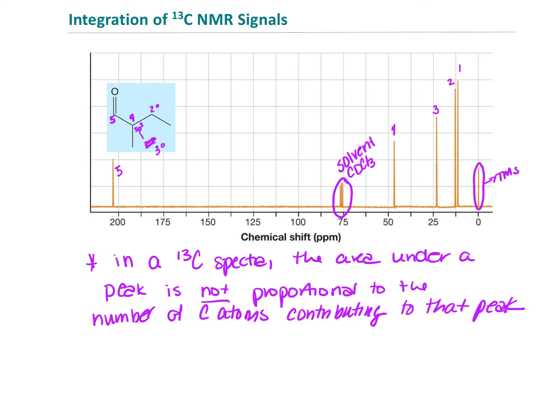This is a secondary carbon, and that's a primary carbon. Okay, so it's a tertiary carbon. We see that in the 4 position there. And so what we're going to see here is this is going to be in the 3. And so that'll correspond to the 3 there. And that'll be the 2, which will correspond to the 2 there. And then that 1 is the farthest away from everything and corresponds to the 1 there. And so that's how we can go through and analyze these. And that's what you're going to do in your packets.